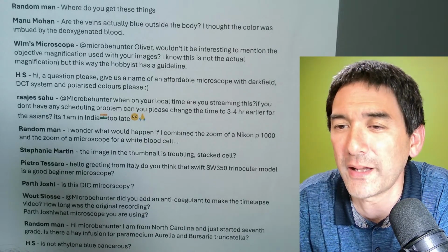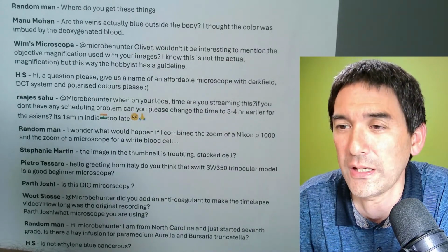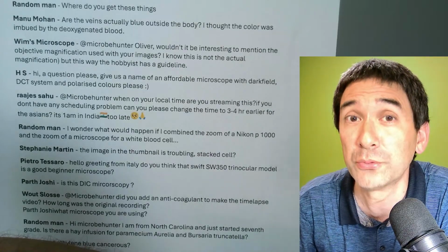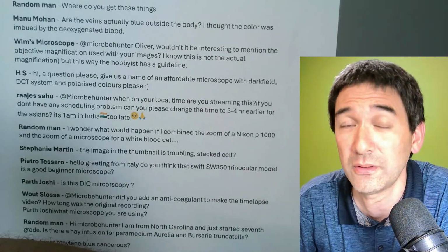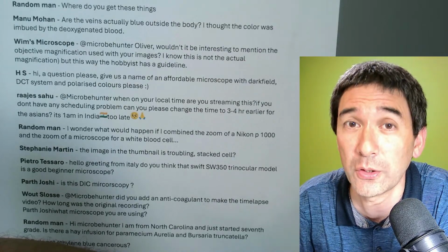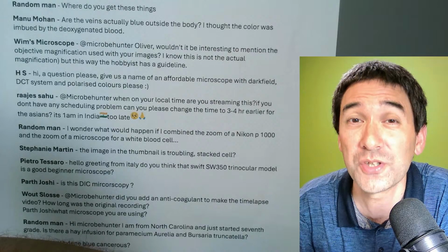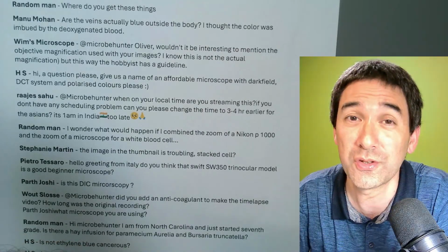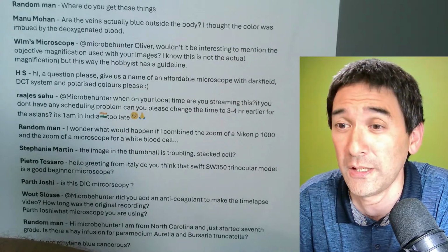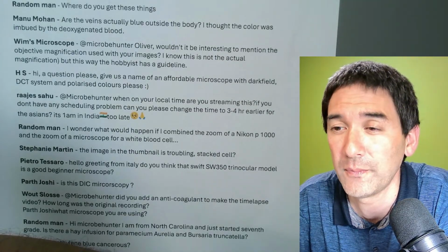Yeah, my new hobby is buying old microscopes. Just like to have them. Yes. Some people actually, especially for some old brand models, Zeiss, Olympus, Nikon, from the 1970s, 80s, sometimes there is still quite a lot of second-hand equipment available. Apparently, the Zeiss standard model was manufactured in crazily high numbers, and there seem to be lots of spare parts still available. And some folks actually like to assemble their own microscopes this way.